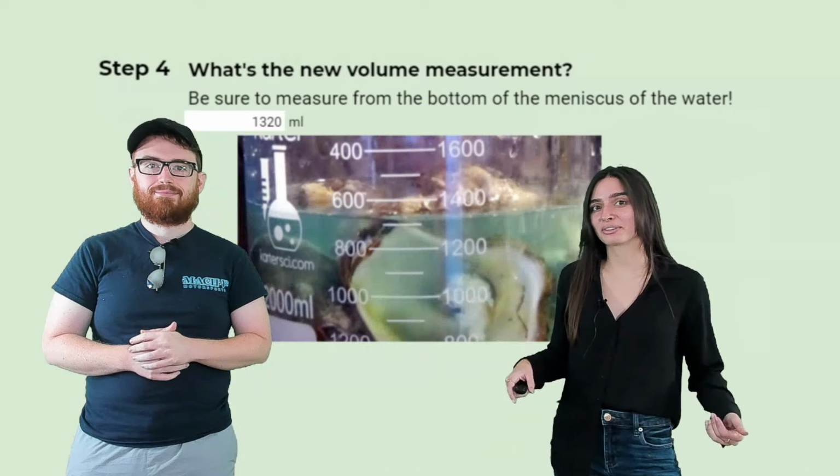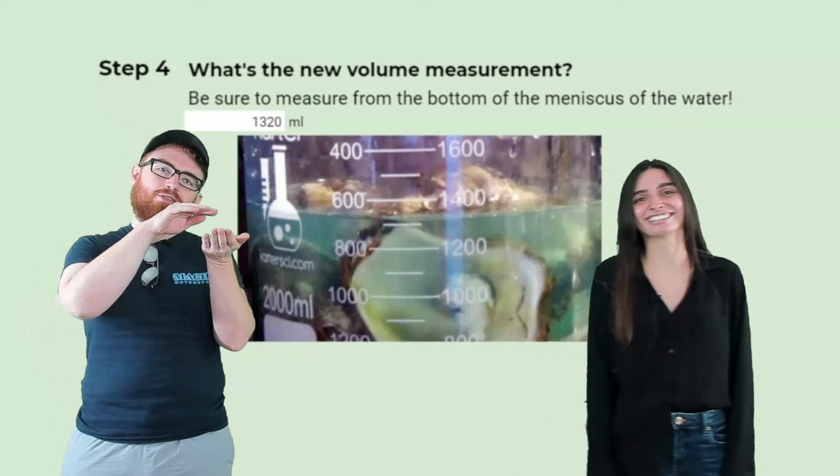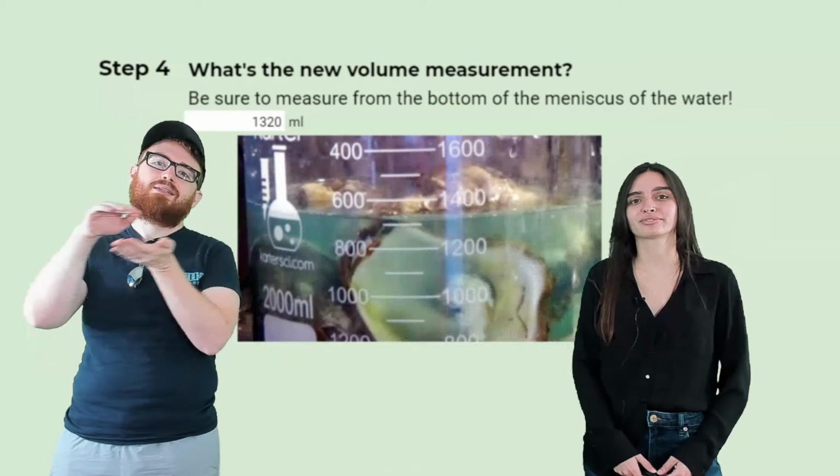And also, you're going to want to pay attention to the meniscus. Yes. So when you measure, you should measure from the bottom line that the water makes. That's called the meniscus.